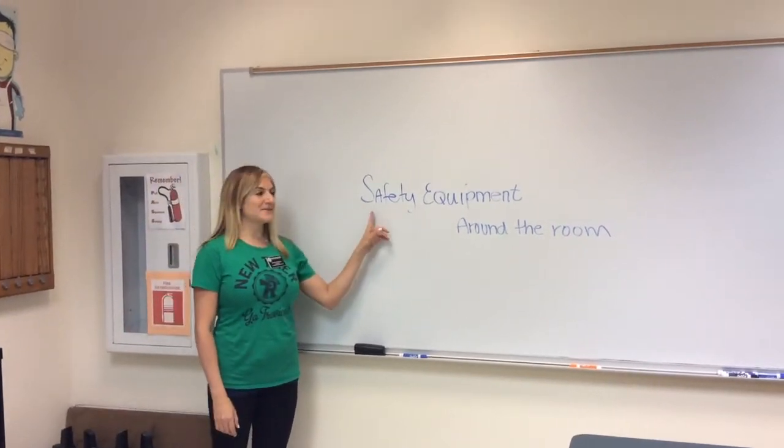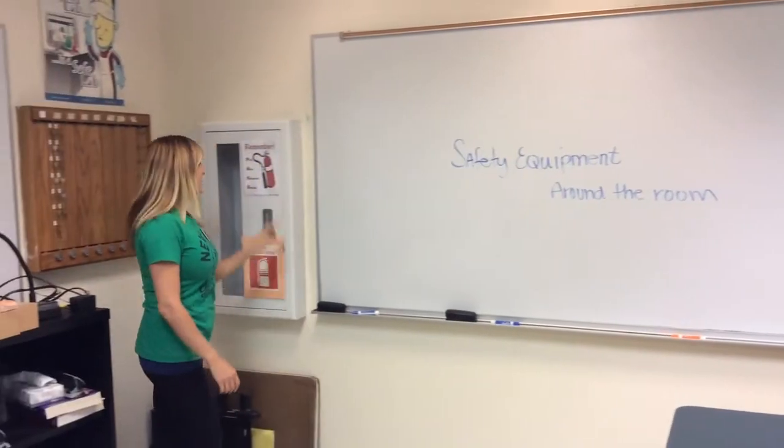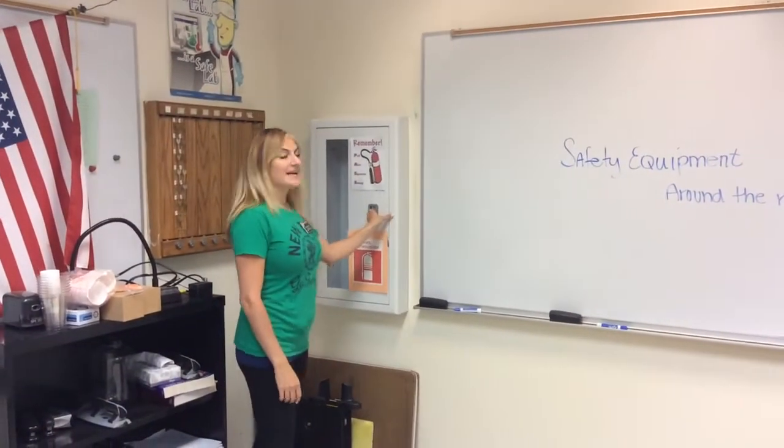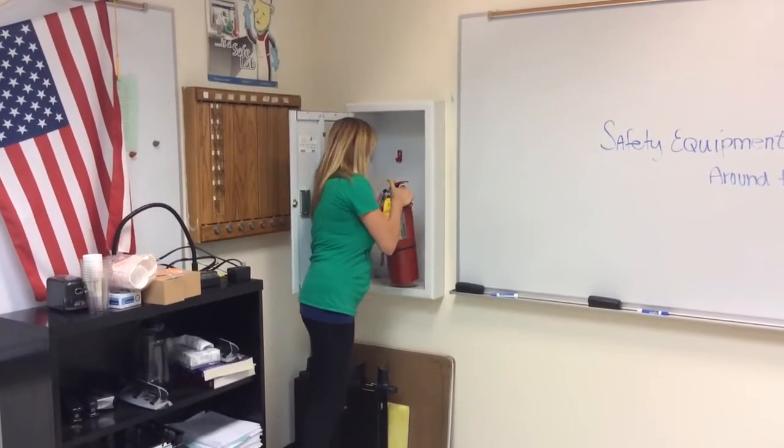Everybody, this video is about safety equipment around the room. Today we're going to start with the fire extinguisher. Inside this cabinet, next to the teacher station, is the fire extinguisher.